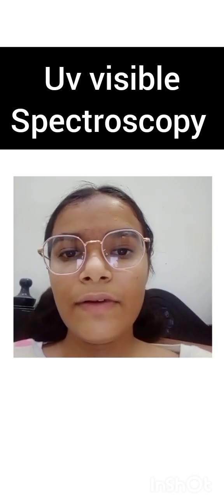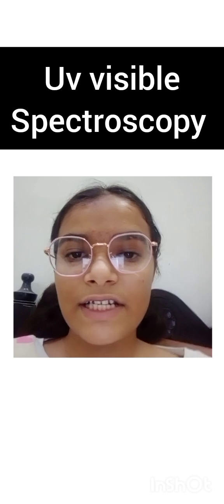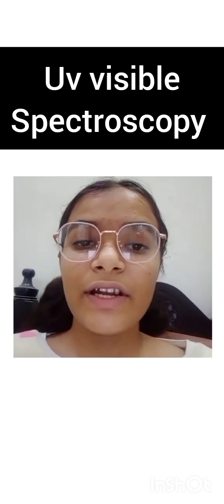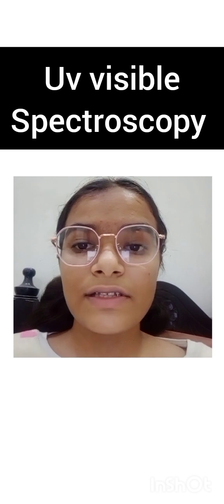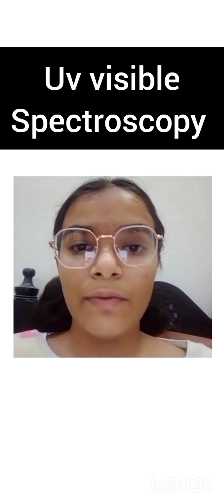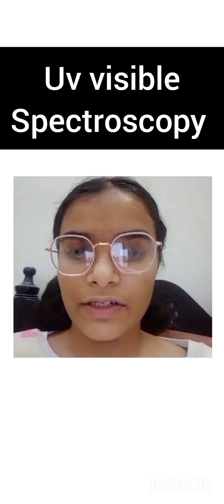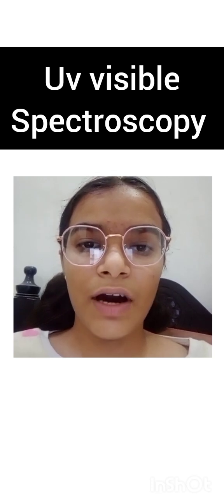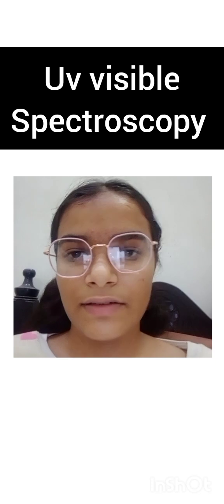Now we will discuss the presentation of spectra, how we represent the spectra. The ultraviolet visible spectrum is generally recorded as a plot of absorbance versus wavelength. The choice of the solvent to be used in ultraviolet spectroscopy is quite important. Usually, solvents that do not contain a conjugated system are most suitable for this purpose.